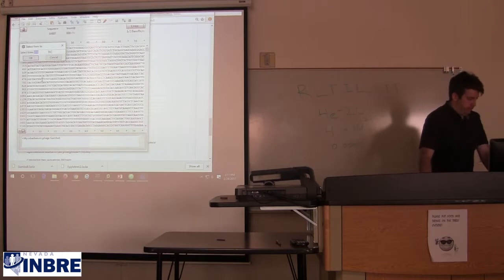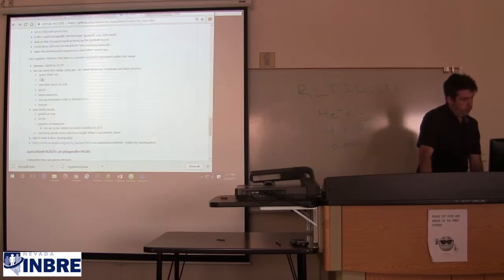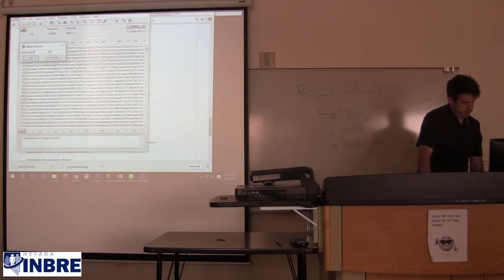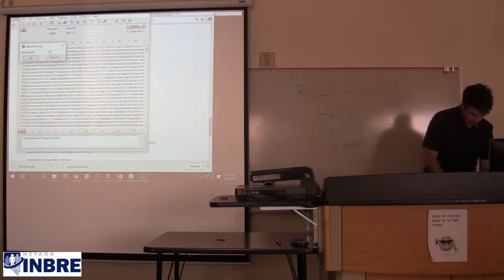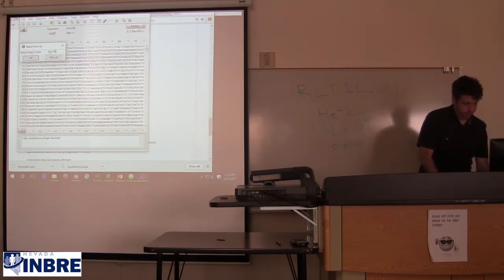It pops up this little dialog, and because we aren't expected to memorize two five-digit numbers, type 16,320 into the left box, to 21,107. And we're going to click OK.